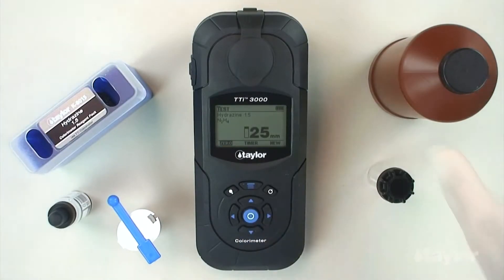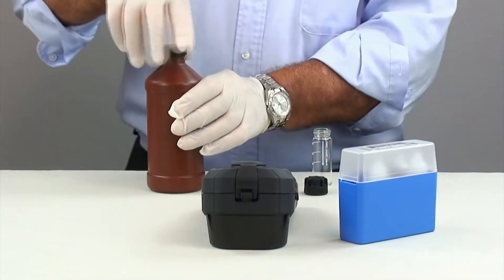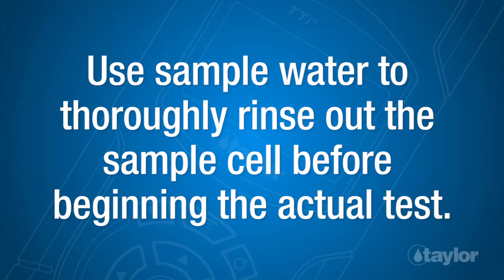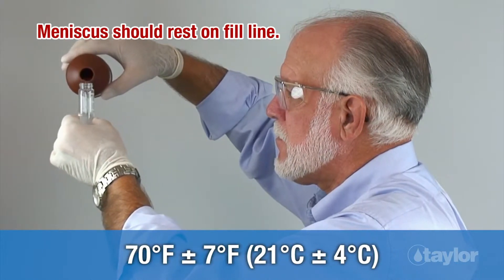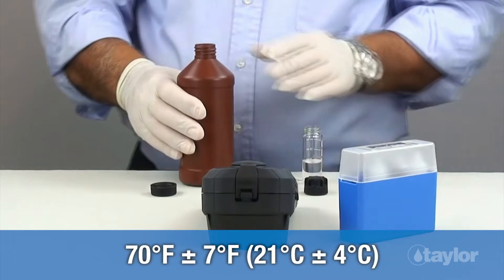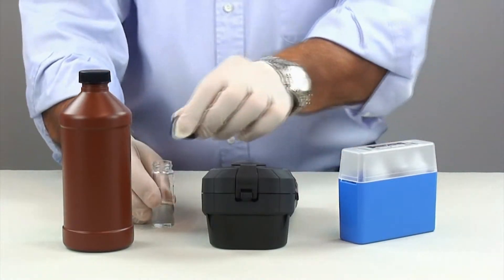Rinse and fill the 25-millimeter sample cell to the 10-ml mark with the sample, then cap. Note: sample temperature should be 70 degrees Fahrenheit, plus or minus 7 degrees, or 21 degrees Celsius, plus or minus 4 degrees. This may require proper cooling of the sample, being careful not to expose the sample to air.